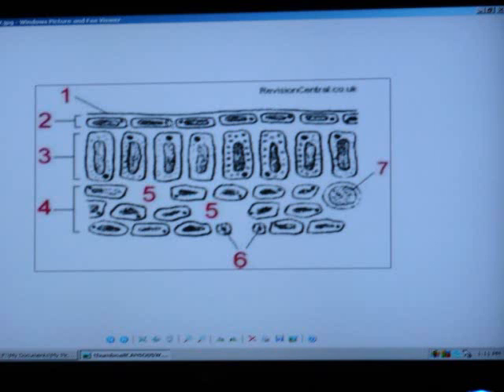Epidermis. All right. Now, there's an opening, right? What do you call the opening? Stoma. Now, what do you call the two cells that make it open and close? The guard cells. The whole thing is a stoma, but the two guard cells open and close it. So the guard cells make the stoma.